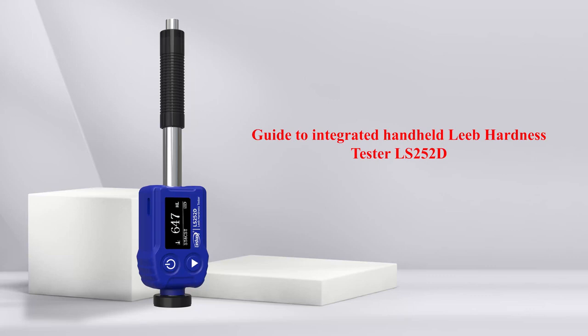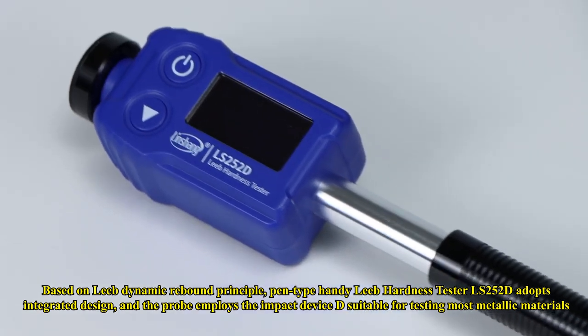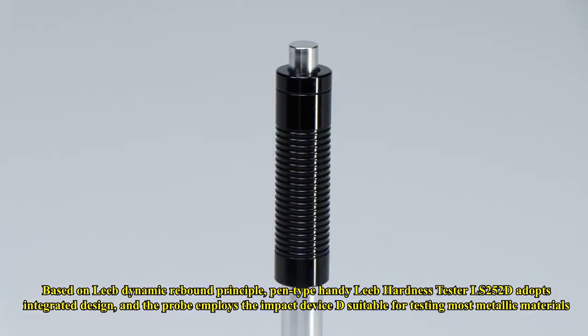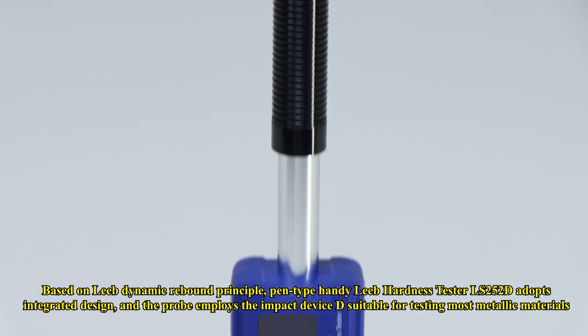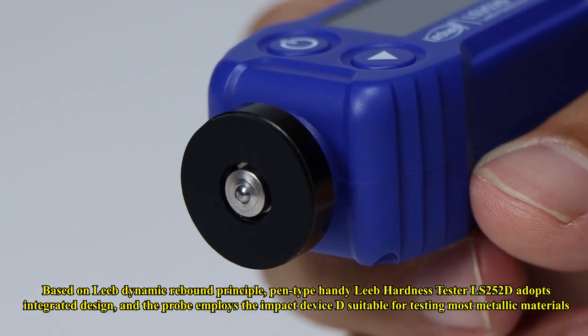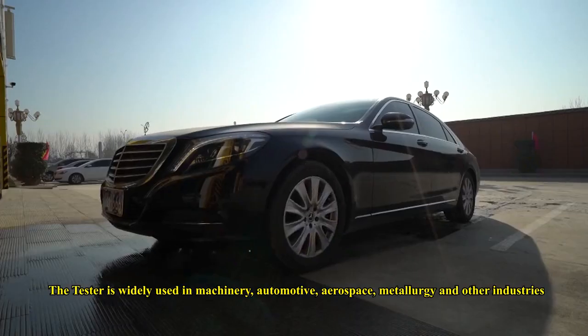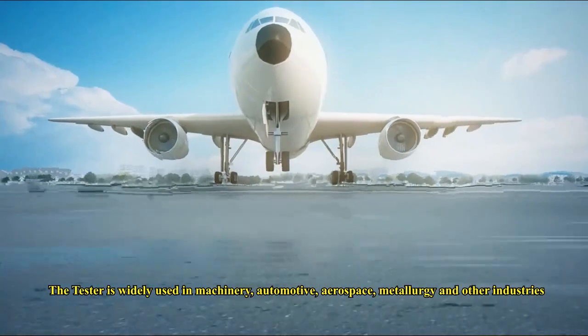Guide to Integrated Handheld Leeb Hardness Tester LS252D, based on the Leeb Dynamic Rebound Principle. The PEN-Type Handy Leeb Hardness Tester LS252D adopts an integrated design, and the probe employs the impact device D suitable for testing most metallic materials. The tester is widely used in machinery, automotive, aerospace, metallurgy, and other industries.